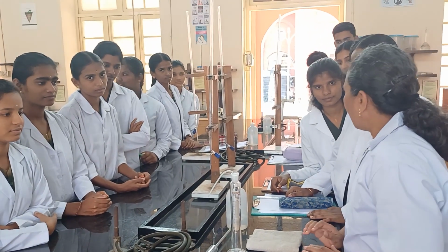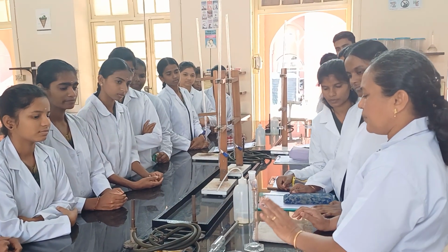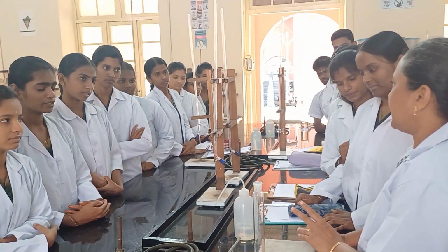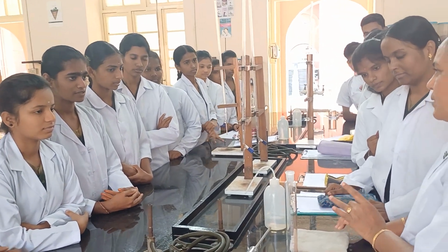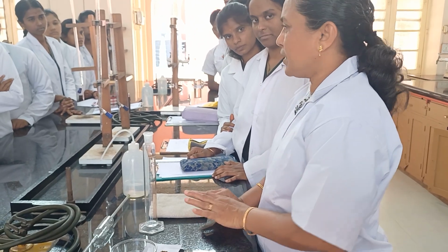Dear students, now I am going to explain about the cylinder method. This method is used for the determination of bulk density, particle density, and percent pore space of a soil sample. All three parameters can be estimated using this method.